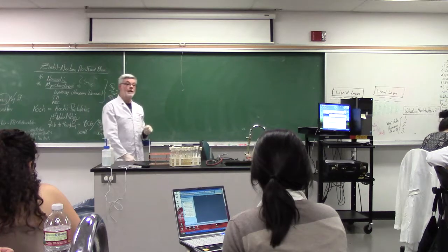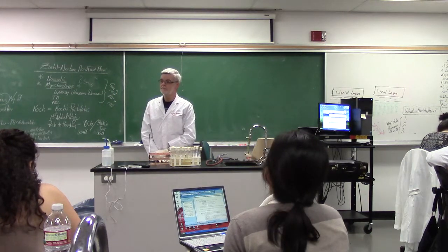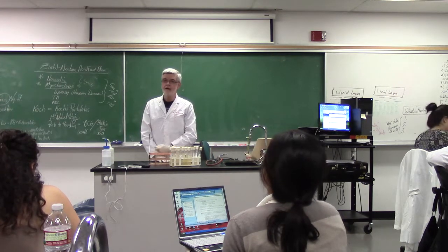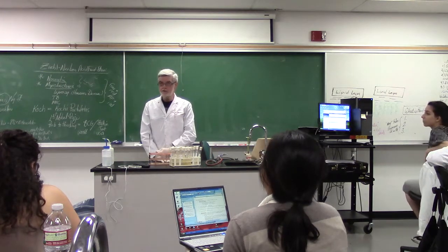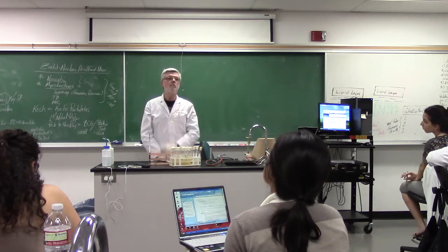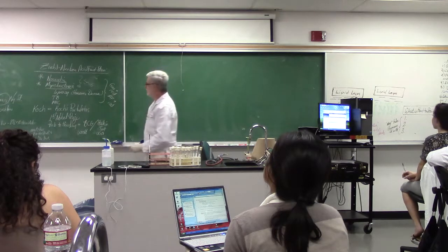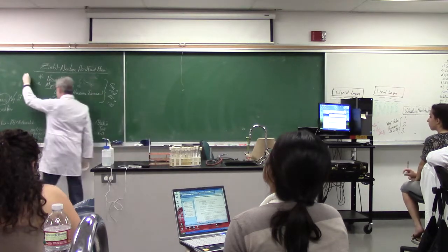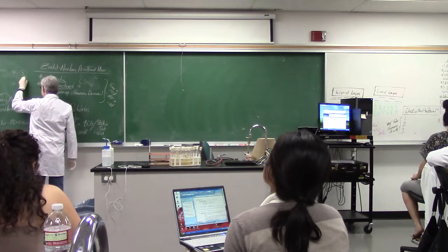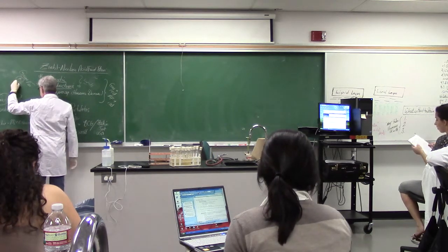And they are gram-positive, but what's unusual about their being gram-positive? They look gram-positive under the microscope when you do the gram stain, but intellectually we call them what? Do we call them gram-positive, or what do we call them? Gram variable on the positive side. So there's gram variable on the positive side.